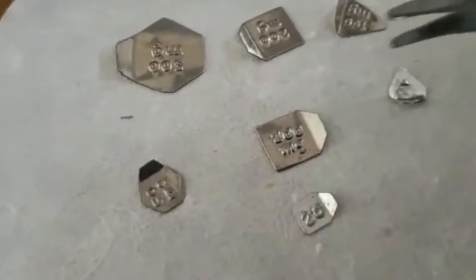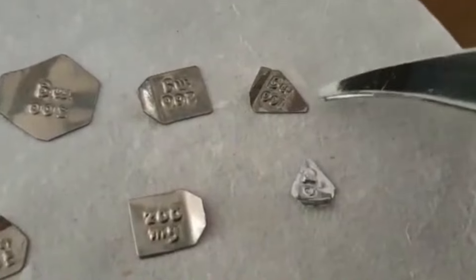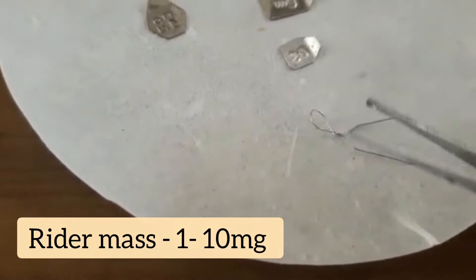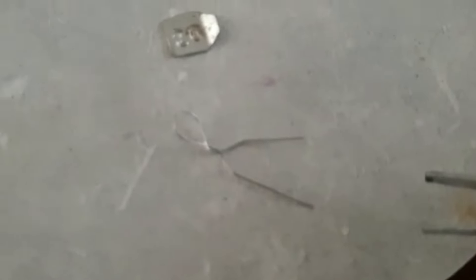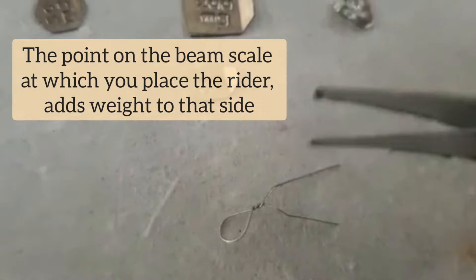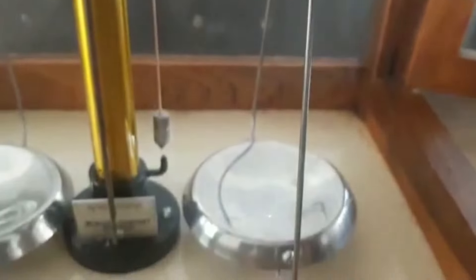We also have: 200 and 20 milligram rectangular weights, 100 and 10 milligram triangular weights. This loop is called the rider. When placed on the rider scale, the rider adds 1 to 10 milligrams of mass. If I place the rider at the point reading 3 milligrams, it will add 3 milligrams towards that pan — it is used for very fine adjustments.